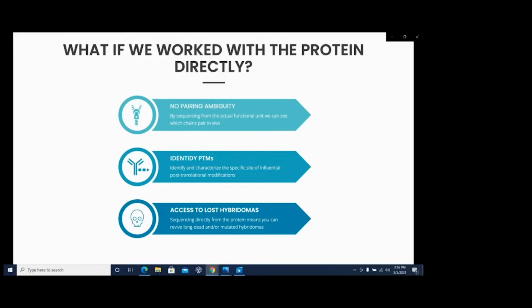But when we look at the proteins directly, even the tiniest amount of protein sample left buried somewhere deep in your freezer means that we could actually have potential of recovering the antibody sequence from a completely de novo approach, rather than having to start the entire library 100% from scratch.